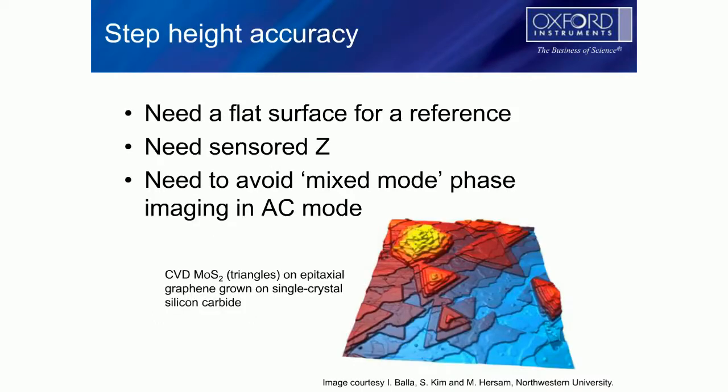All right, so let's start right off. At its base, AFM, atomic force microscopy, measures topography, right? That's the primary function of it. And so you would think that would be a very good use for this instrument on these 2D materials. But there are some requirements if you want to get accurate height data on these flakes and various materials. For one, you typically need a flat surface for a reference.